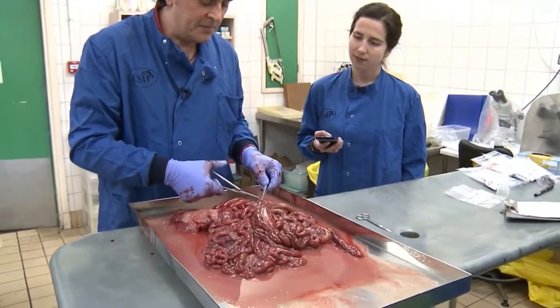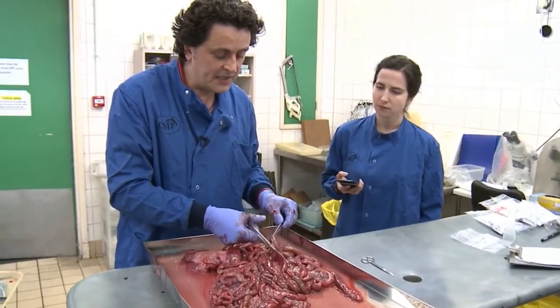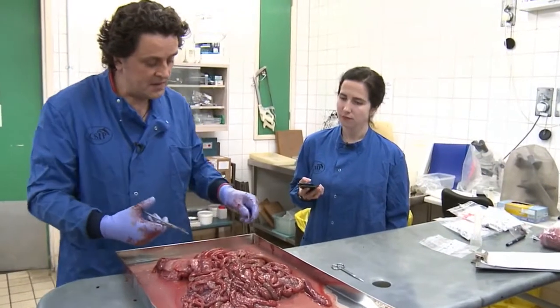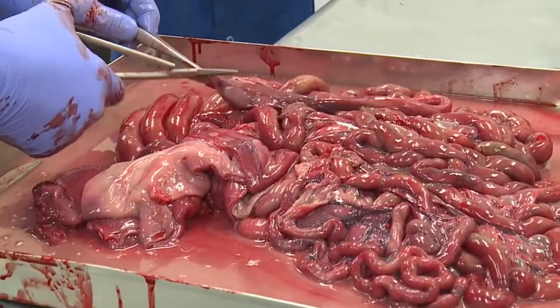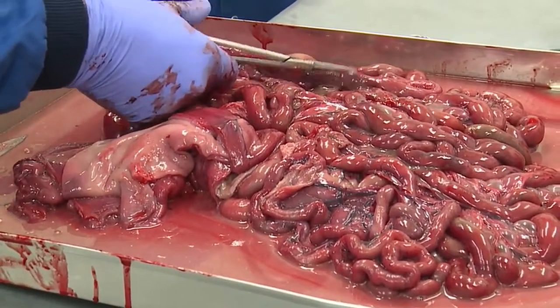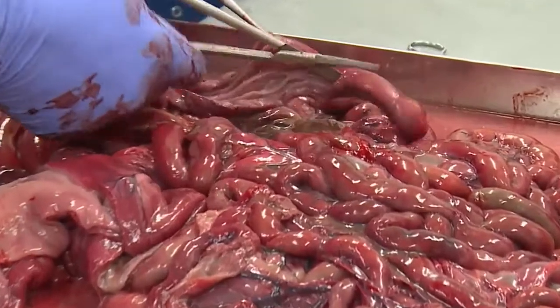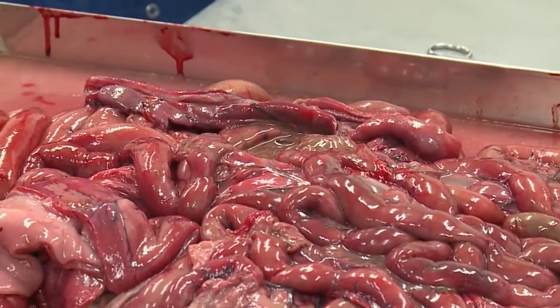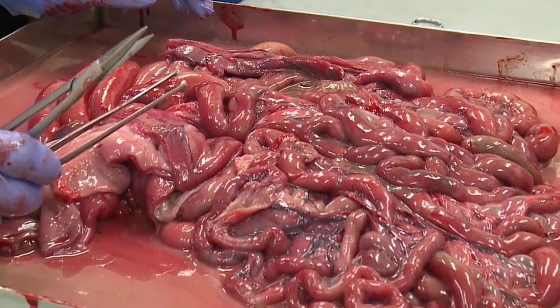Okay, so just nipping this open a few places, I can see a picture here of pockets of digesta. So it's been feeding, certainly at around the time of death, but it's been feeding before that quite happily as well. Let me just check the rectal end. Okay. So that's probably it on the guts front, Matt?